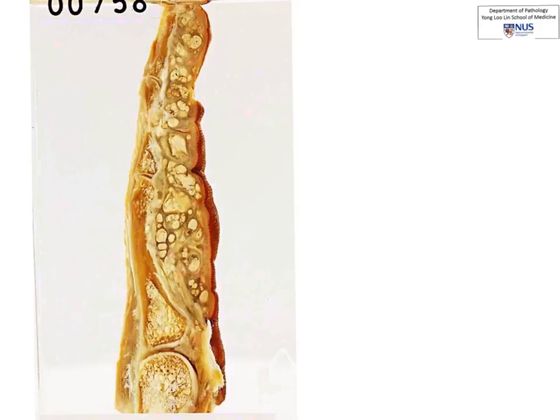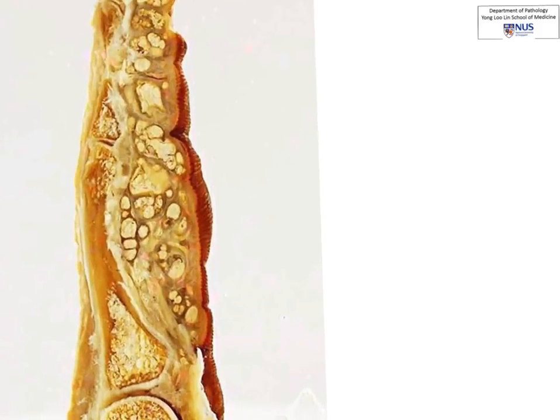If you look closely enough, you can just about make out some of the deposits within the periosteum, which is markedly thickened. So these deposits are gouty tophi, and they are composed of monosodium urate. The diagnosis here, therefore, is chronic tophaceous gout.